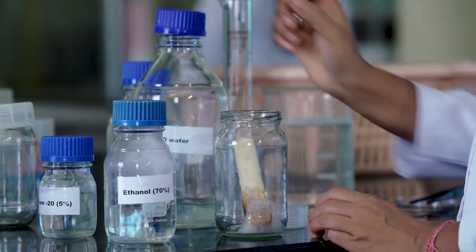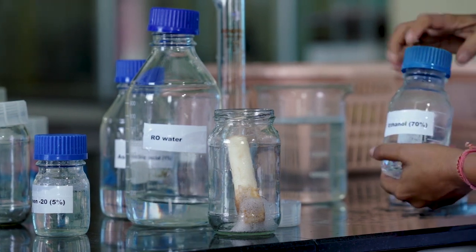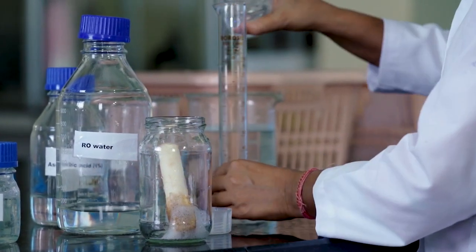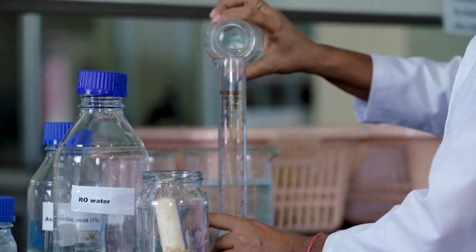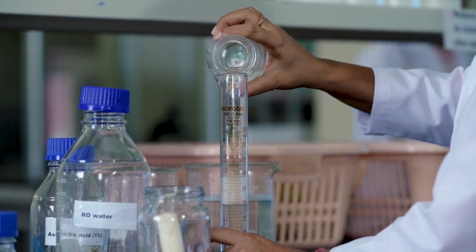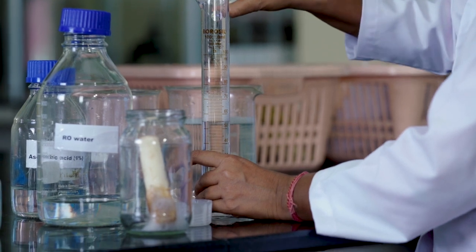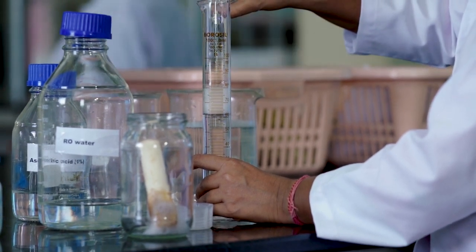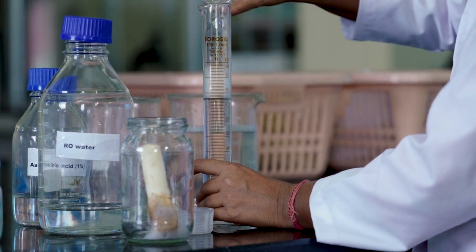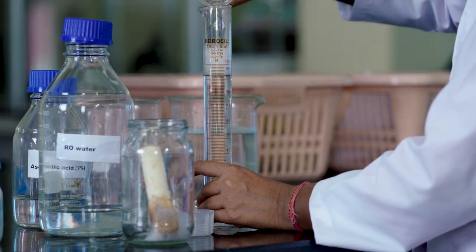After this process, we need to treat the explant with 70% ethanol, so that any contamination remaining on the explants will be removed. Here we are using 70% ethanol to treat the explant, that is the shoot apical meristem collected from the healthy mother plant.